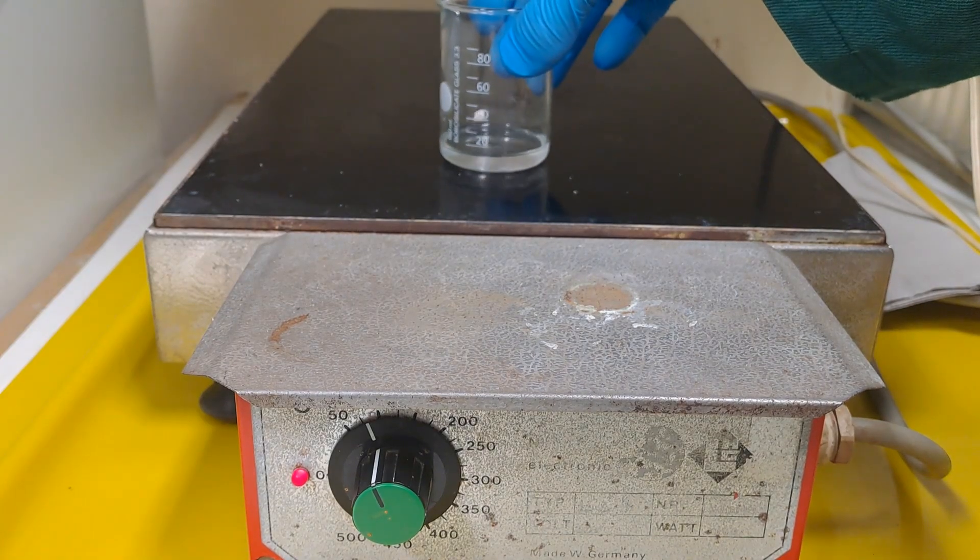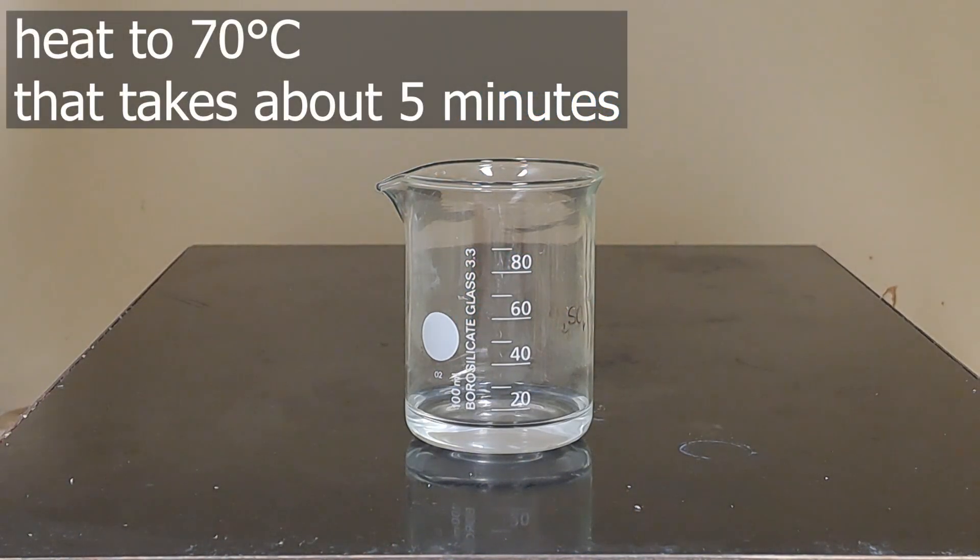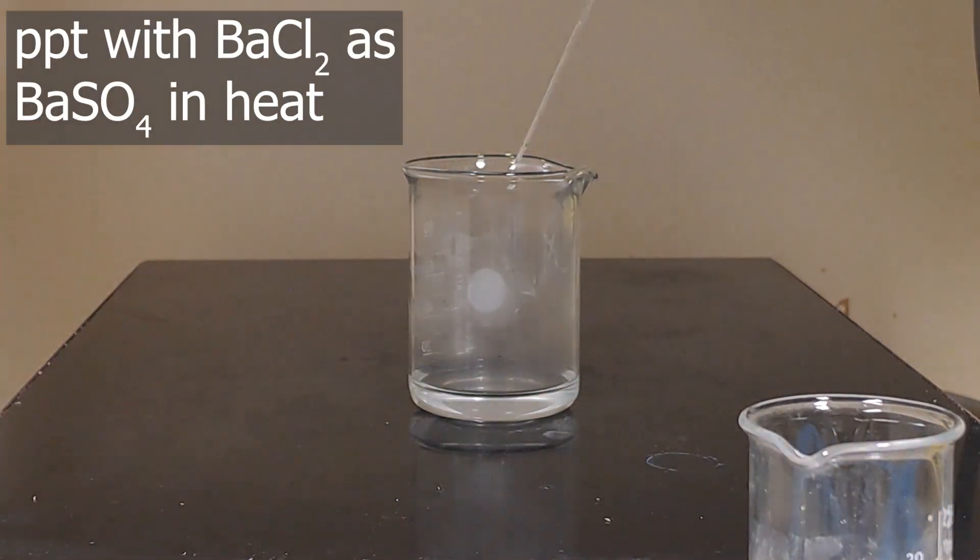Heat this mixture for about five minutes until it's warm, not boiling. Visible condensation on the beaker is a good indicator if it's warm enough. Add enough barium chloride until no more precipitate forms.